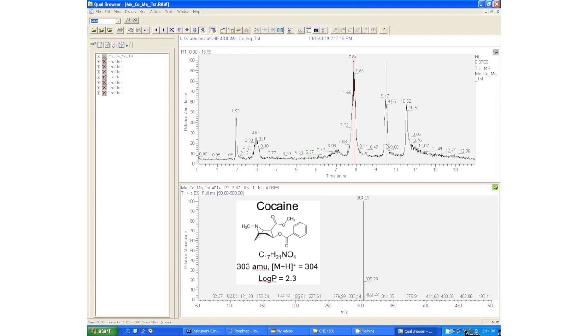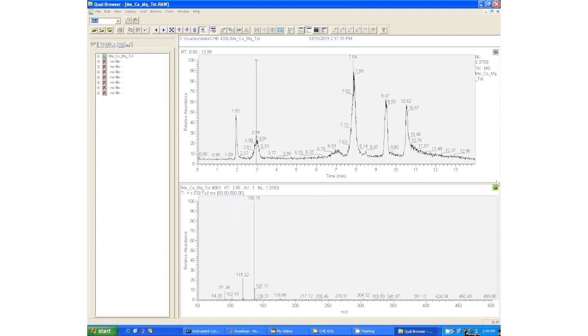So let's look at another one of these peaks. When we click on this very first peak over here, we get this peak at 136 which correlates to what we would expect for the protonated molecule for amphetamine. And again you can see its log P is a lot less than cocaine, and so it comes out much earlier than cocaine on this C18 column.